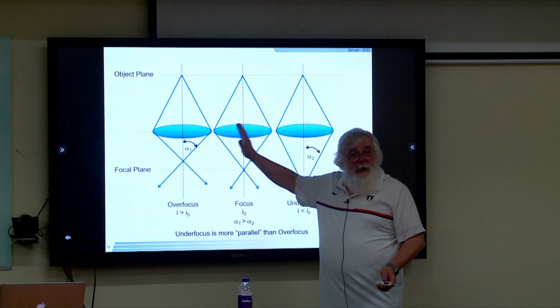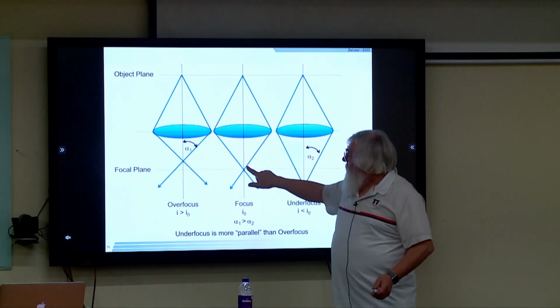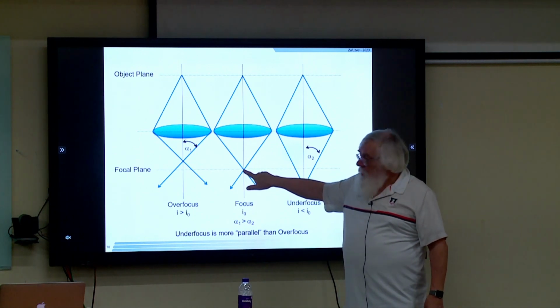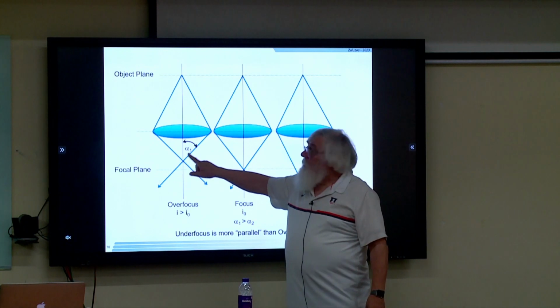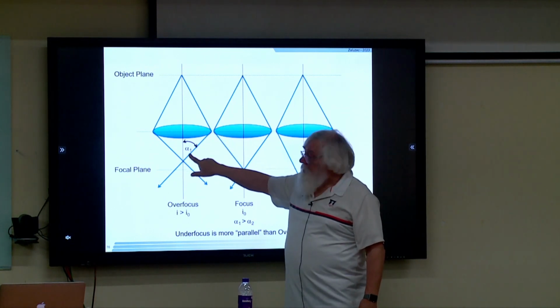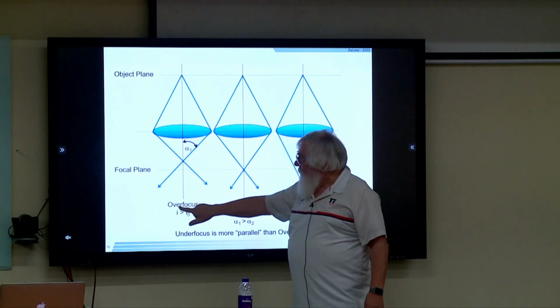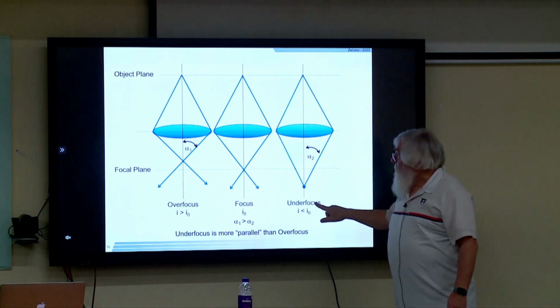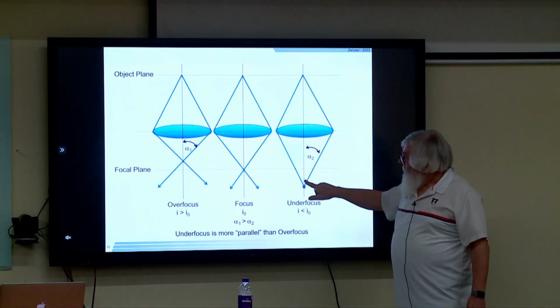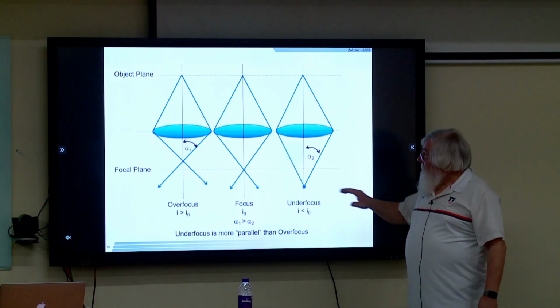When I say the probe is focused on the sample, that means the beams converge. Forgetting about aberrations, they focus right on the sample. If the probe is over-focused, the lens is really strong because it's focusing shorter. So that's an over-focus condition, and the current is greater than what you need to reach focus. And if we're under-focused, the lens is weaker.